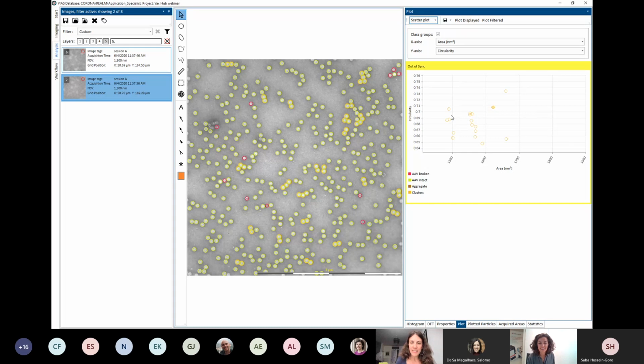Fantastic. I can send you an email. I have one more little question: does your sample holder hold only one grid? Because this is another time-consuming bit where you wait for the vacuum to close and so on. It does. The plan is that it will have a 3-grid holder, but that is the plan. We understand that it is time-consuming, and I think one of the things that will be taking the most time is going through the sample exchange. But yes, unfortunately, at the moment we only have one. Okay. Thank you. No problem.